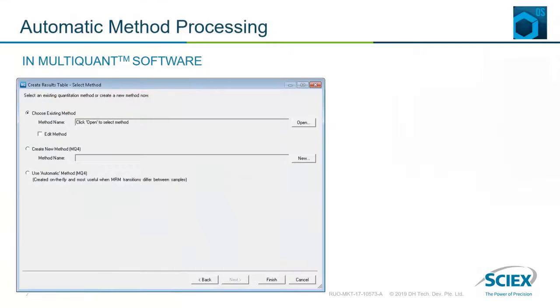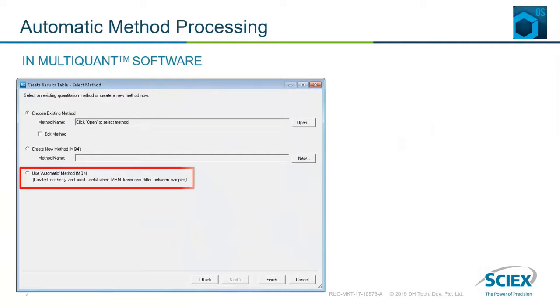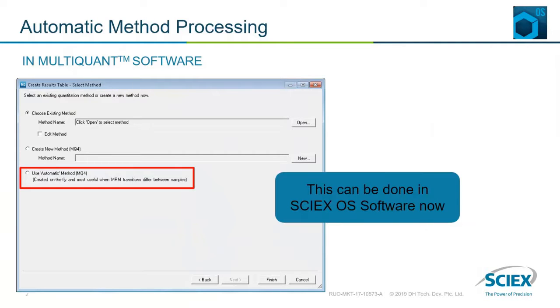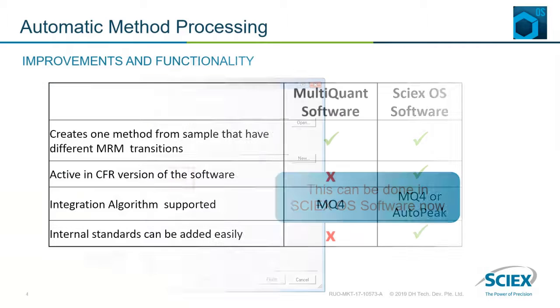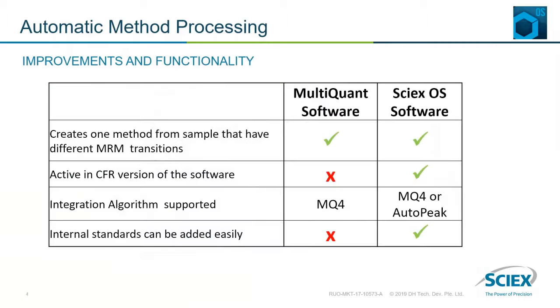This function is available in MultiQuant and can be performed in SciXOS too. There are differences between automatic method processing in MultiQuant and SciXOS. However, they both have the primary function of creating one method from samples that have different MRM transitions.